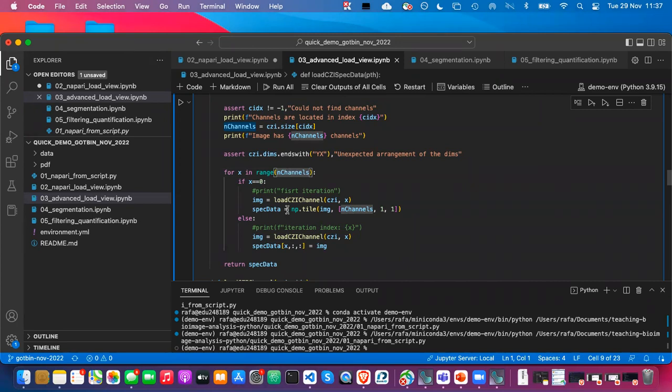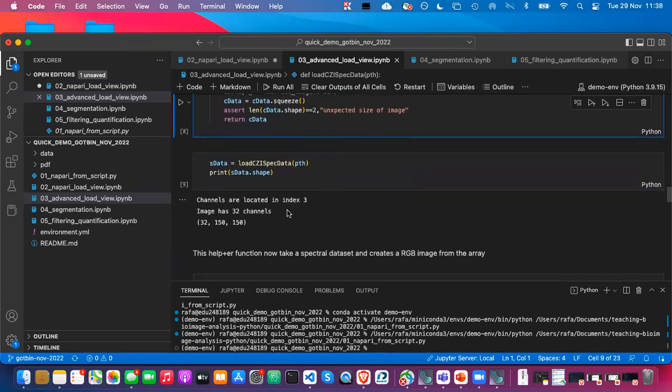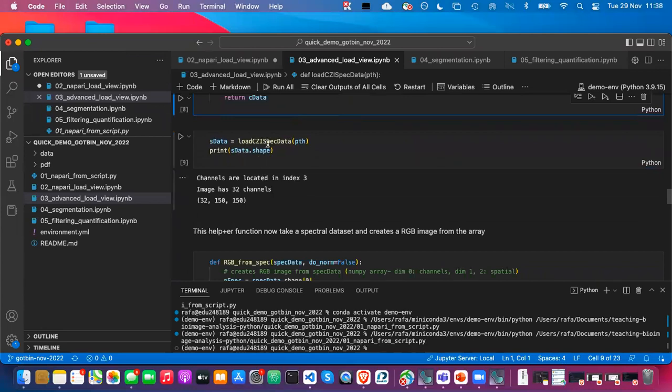All right. Now, the important thing for Napari is to know what the axes in your multidimensional array mean. When you load, you can actually choose which axis is the X dimension, which axis is the Y, which axis is the channels. It's like a free-for-all. There are some recommendations, but you can also identify in Napari what is what, and it will know how to digest that. So for example, here again, I'm just using that function.